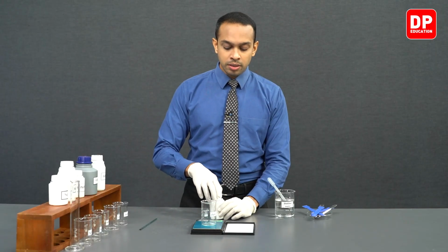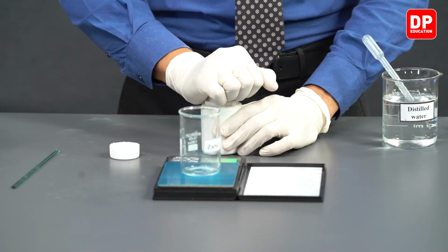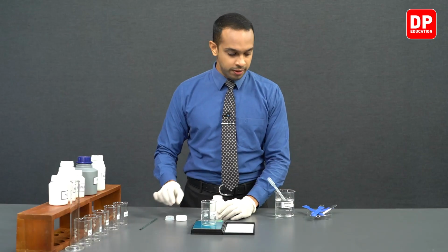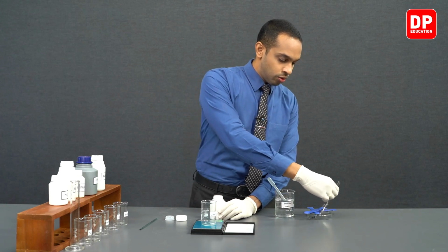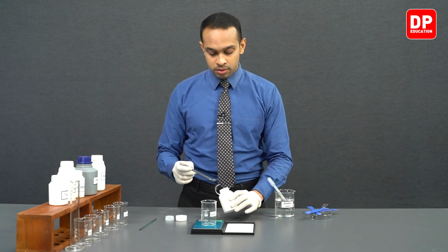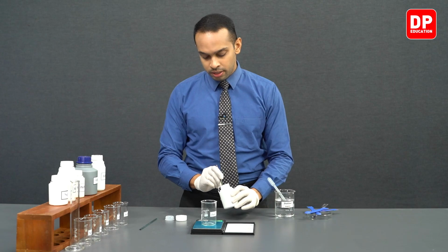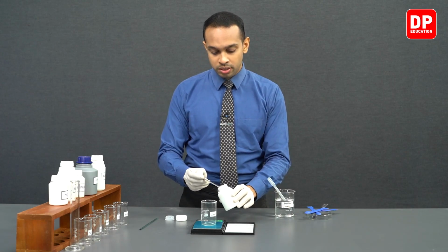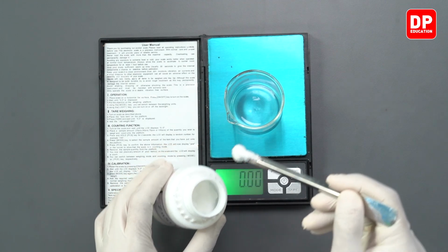and we will measure 8.07 grams of zinc sulfate over into our beaker here. We will measure exactly 8.07 grams.